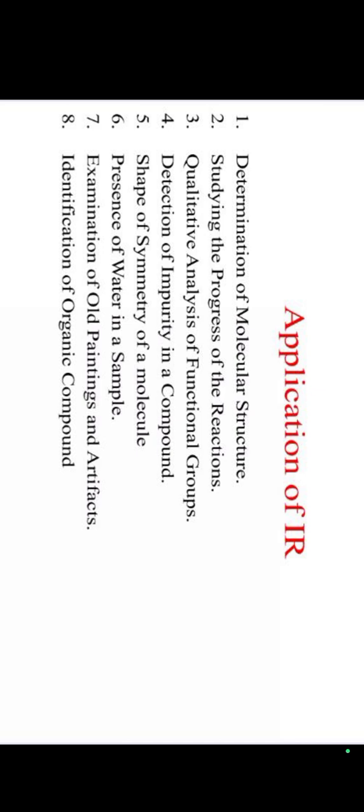And the fifth one is the shape of symmetry of the molecule, to determine the type of symmetry shape of that molecule, which will be identified by the IR spectrophotometer. Sixth application is presence of water in a sample. To identify the presence of water in a sample, that will be identified by infrared spectrophotometer.